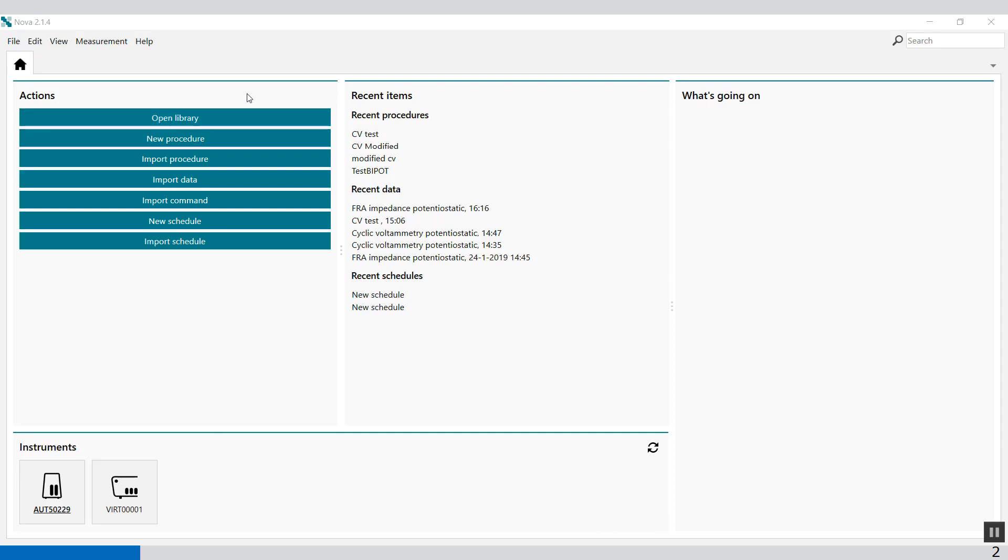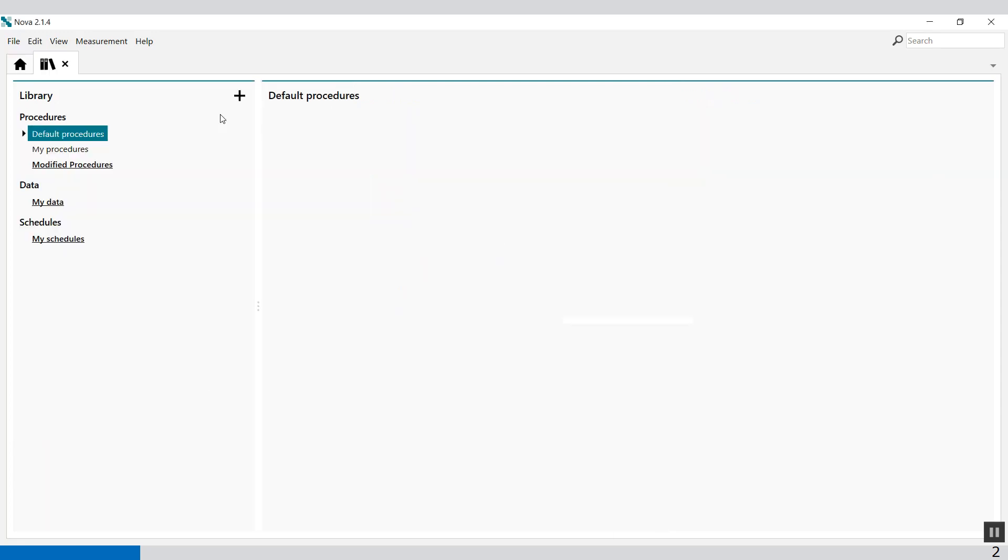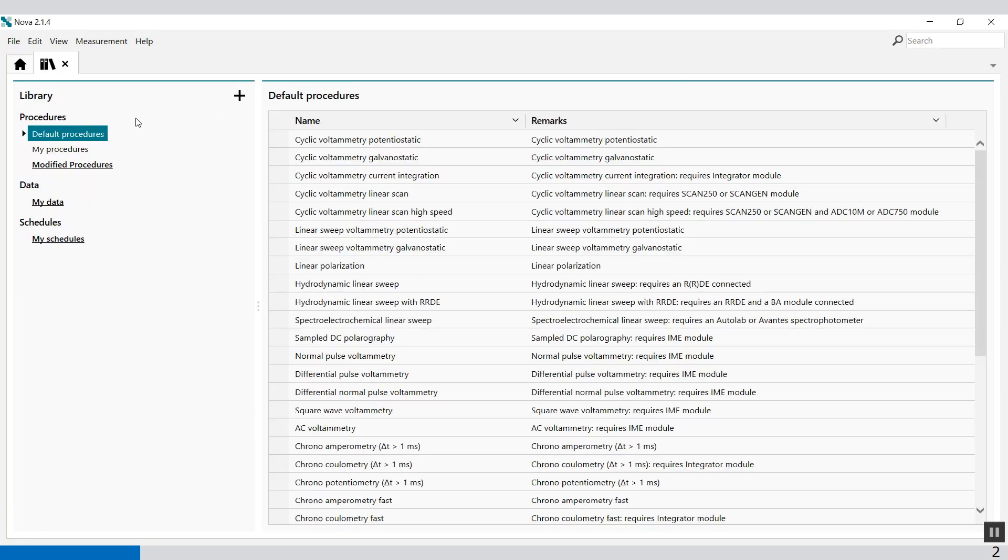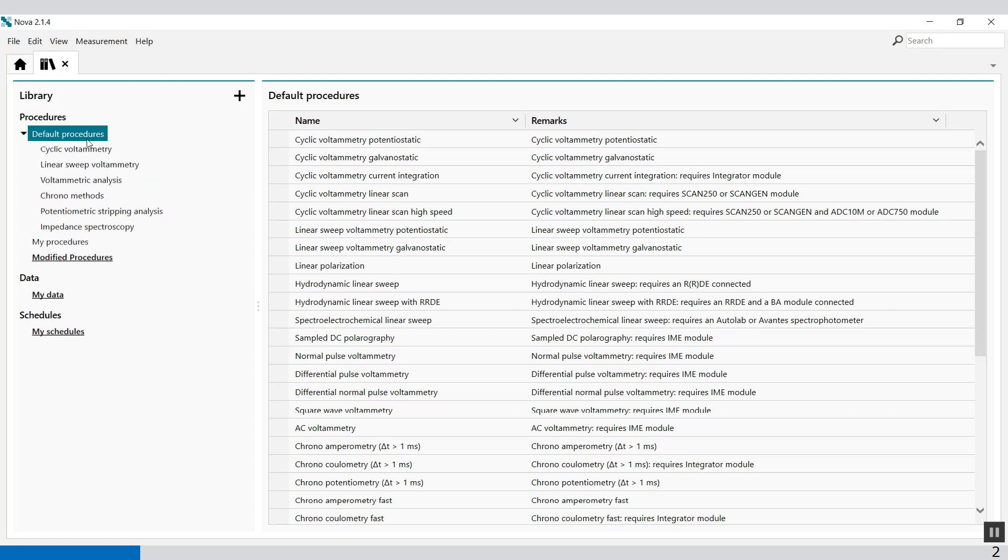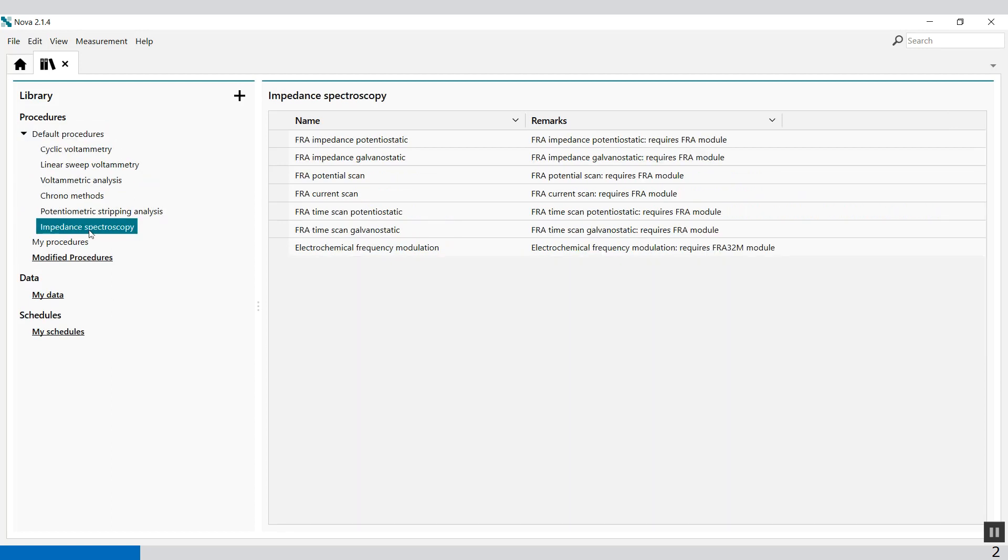First, open the library. In the library you will find the default procedures. Select the impedance spectroscopy, and select the FRA impedance potentiostatic.